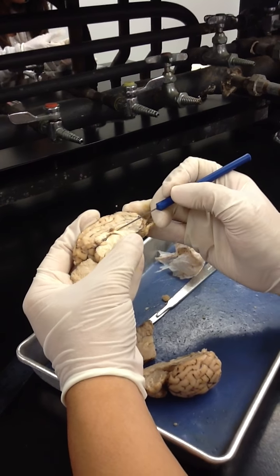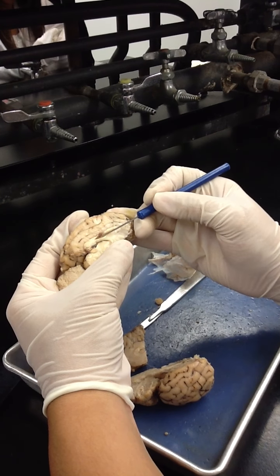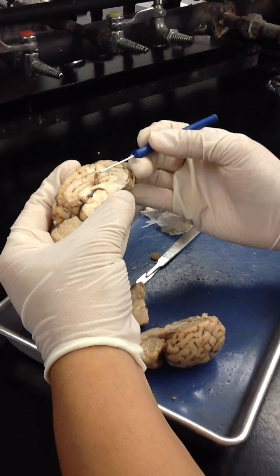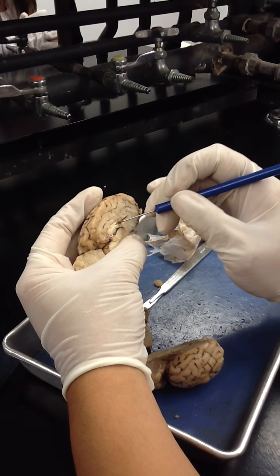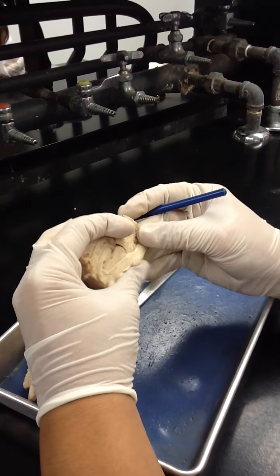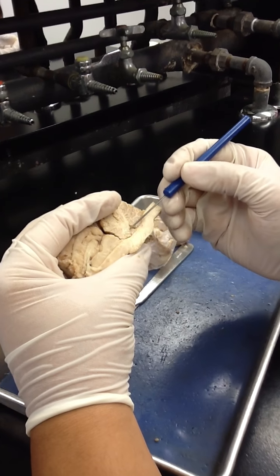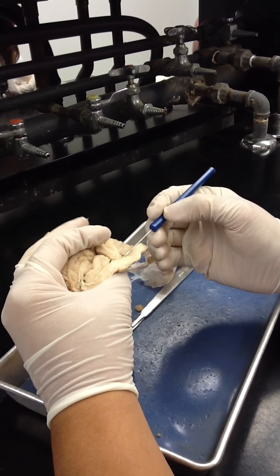That's one of the places where we filter, this set of blood vessels that I pulled out of inside here, called the choroid plexus. Okay, so you can see that. That space inside, remember, is the ventricle. That's the lateral ventricle in there. I think this one's a little better. The space here is the third ventricle. And then the fourth ventricle is right here. So between the pons and the cerebellum is the fourth ventricle.